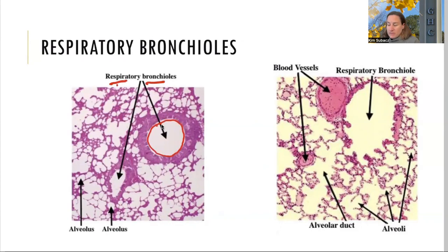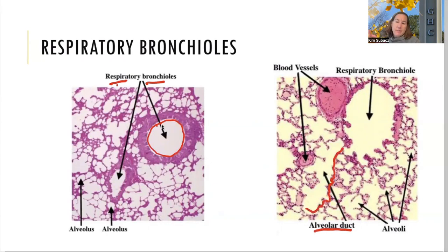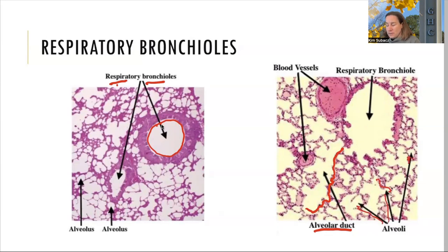Our respiratory bronchioles are going to feed into the alveolar sacs, and those are connected with alveolar ducts right here. These larger open areas are the alveolar ducts. We also have blood vessels running through here because we're going to have capillary beds surrounding the alveolar sacs where gas exchange is going to happen. Here's an alveolar sac — here's one, here's another one — we've got them all over in this slide.